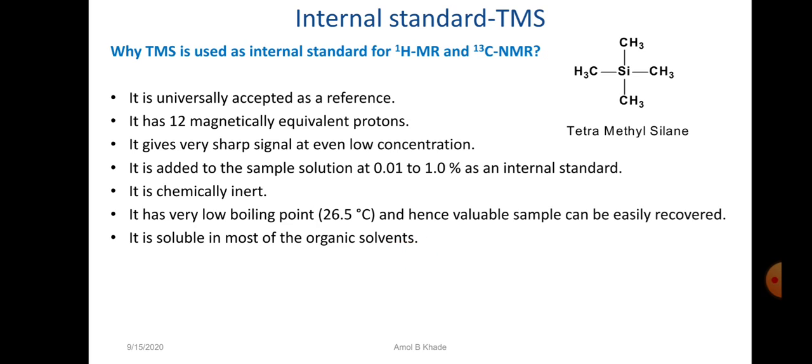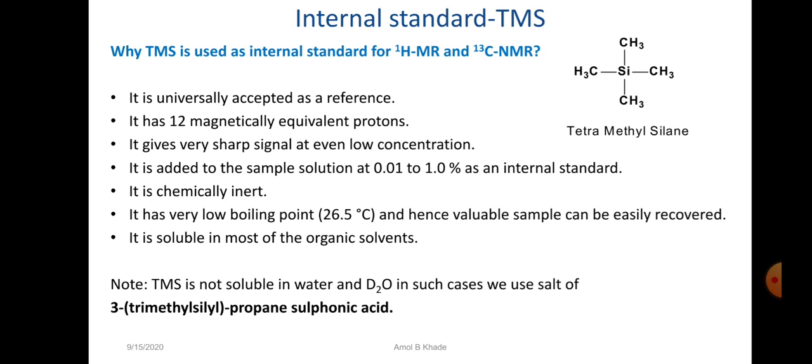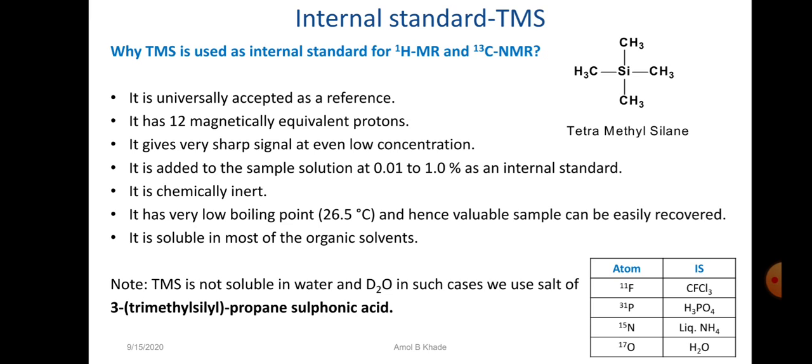We require solvents, usually deuterated solvents, if you are recording NMR spectra with the proton nucleus, and we need to solubilize our solid samples or dilute our liquid samples. In such cases, TMS should have miscibility. It is miscible with almost all organic solvents except water and deuterium oxide. Okay, so TMS is not soluble in water and D2O.